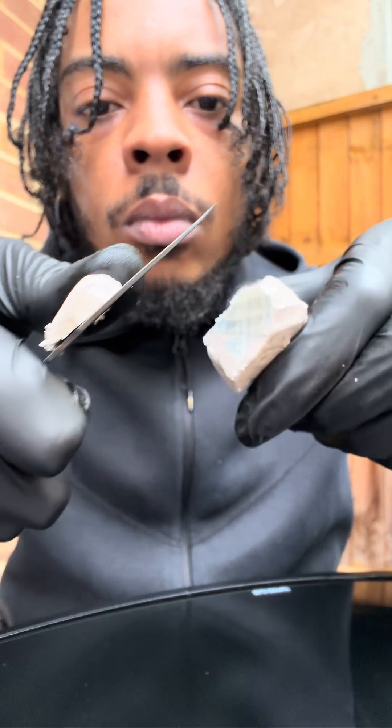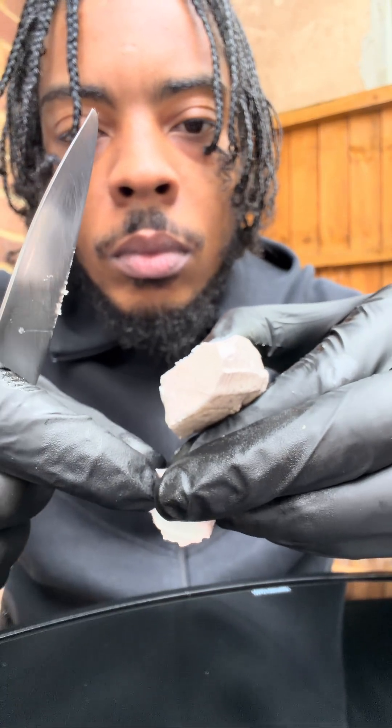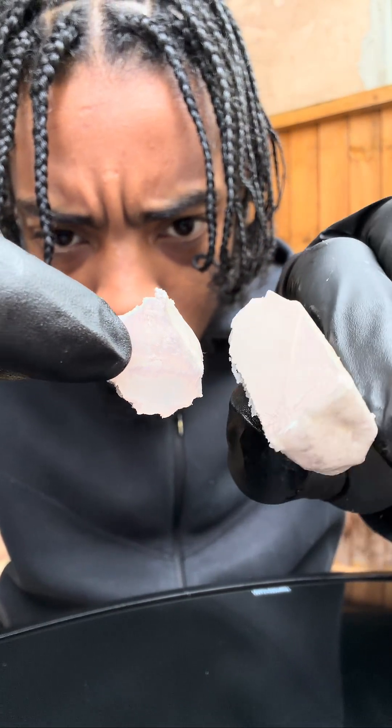We're going to chop up the sodium — it's shiny — but it quickly turns gray when it reacts with oxygen in the air to form sodium oxide.